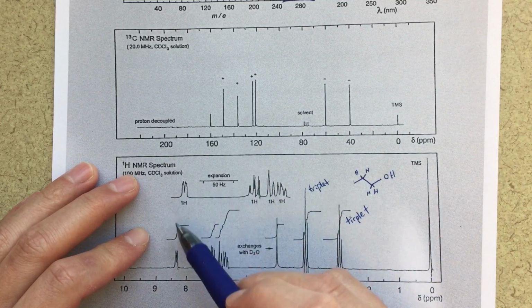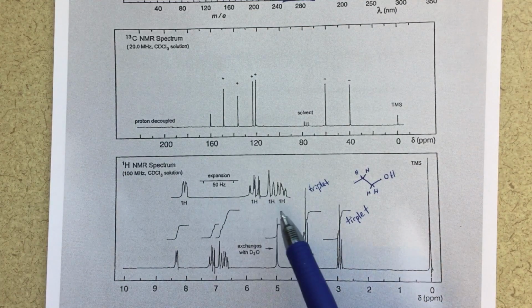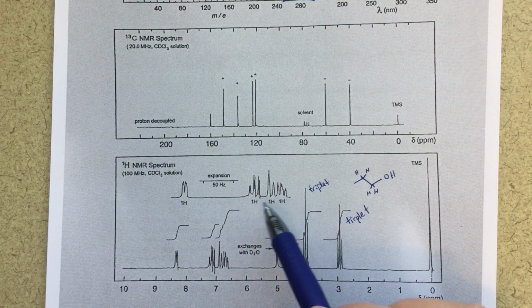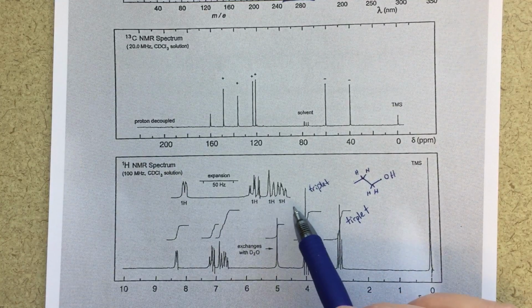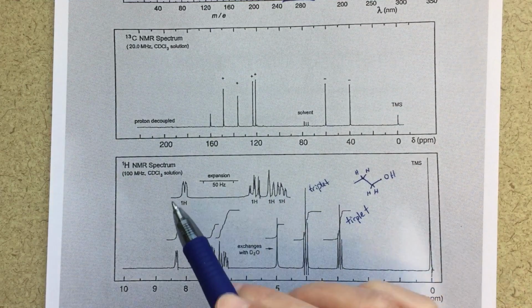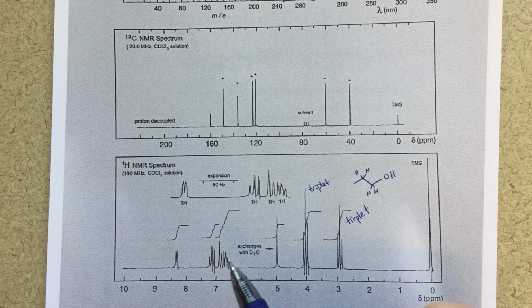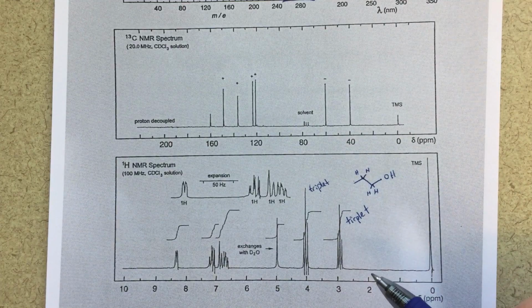So for my aromatic region, the thing that they're sort of hinting at here is that I've got 4 protons in my aromatic region, and I don't have very much symmetry. Like I don't have a mirror plane of symmetry because I've got 4 distinctly different peaks. And this one is definitely even more different than these other groups of 3. So just sort of in the back of my mind, I'm thinking, well, 4 aromatic protons, separate, and then I've got my CH2, CH2, OH. I think that's pretty clear here.